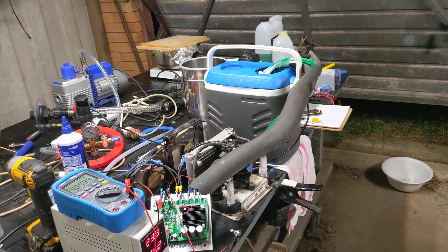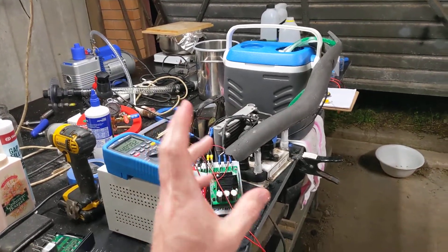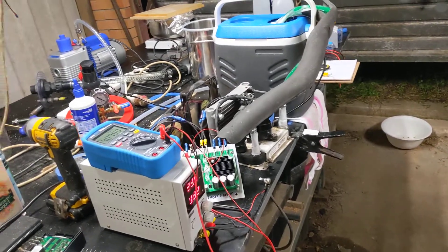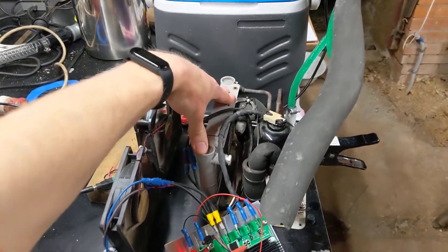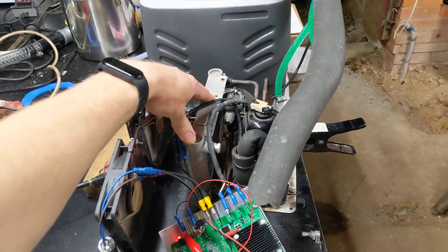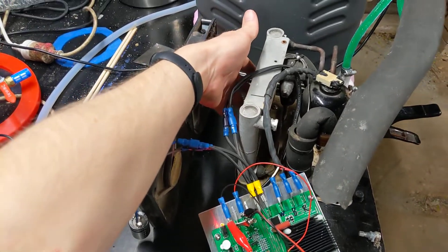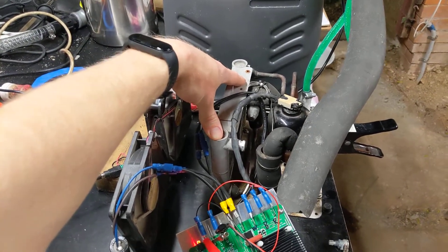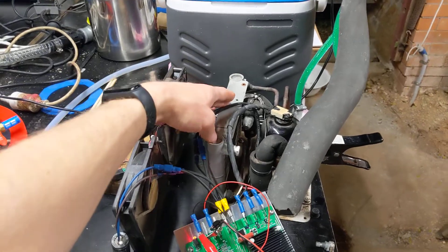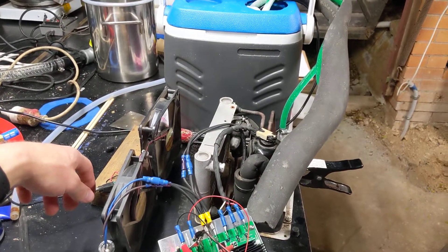At work we had a freezer that went down to negative 70 — it had a two-stage chiller in there. I'm not entirely sure if one chiller got it down to negative 20 and then another took over, or if they both worked in tandem the whole way down. Effectively you'd have another chiller chilling the radiator of the first stage chiller, which would decrease the temperature gradient that each chiller has to handle. Instead of this radiator exchanging heat with the air, I could have another heat exchanger exchanging heat from the coolant loop of another chiller in series. But that would be really hard to get all the plumbing sorted out.